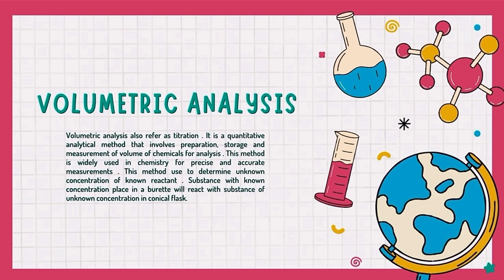This method is used to determine the unknown concentration of a known reactant. Substance with known concentration placed in a burette will react with substance of unknown concentration in a conical flask.